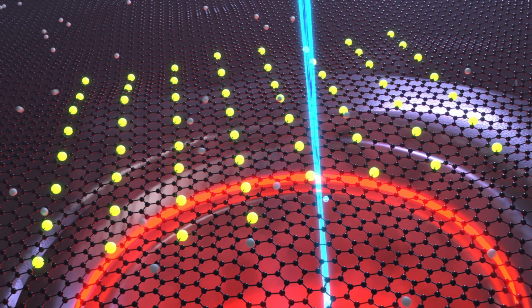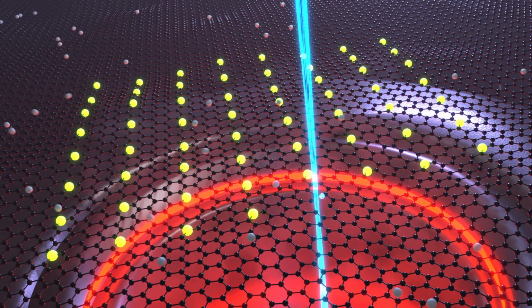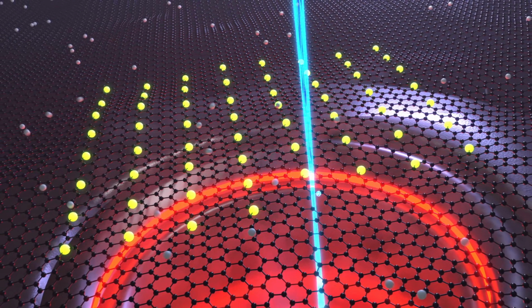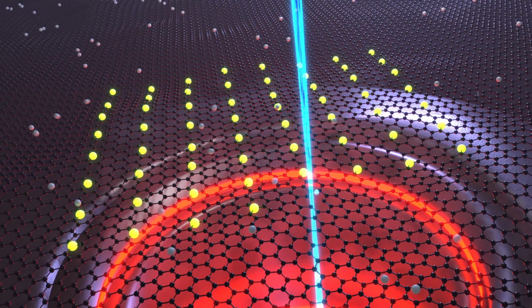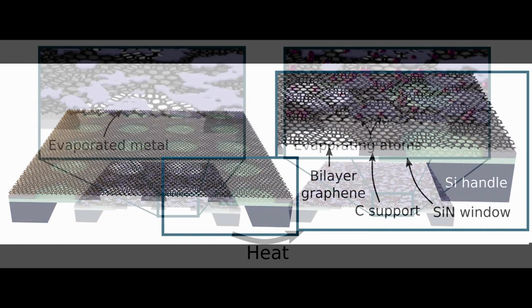In this work, we tuned the environment to produce diffusing copper atoms across the entire sample surface and show that we can attach these atoms to twisted bilayer graphene wherever we like. This process was automated, and we were able to pattern arrays of atoms and atomic clusters into the graphene with limited human interaction. We began by transferring bilayer graphene onto a protochip's heating chip.